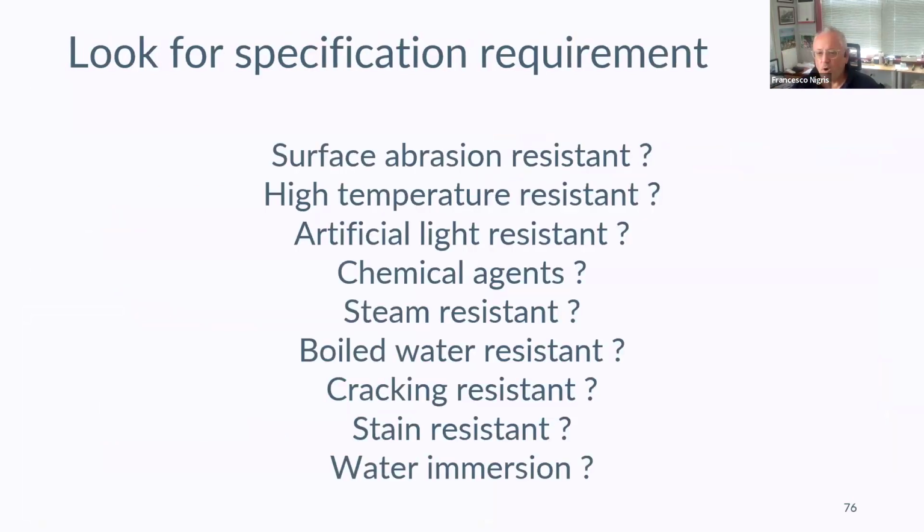And then some other requirements. Sometimes these are things that are evaluated or taken for granted, but ask your supplier: what are the temperature, artificial light resistance, chemical agent, steam resistance? Those are all questions that are important to me.